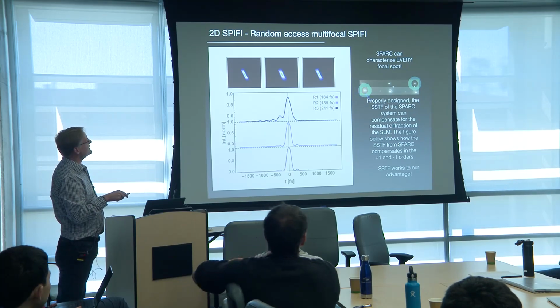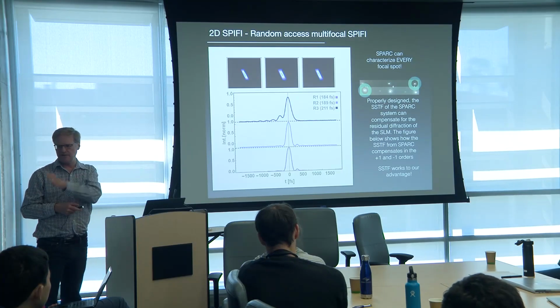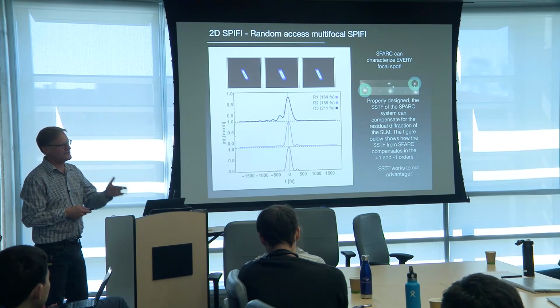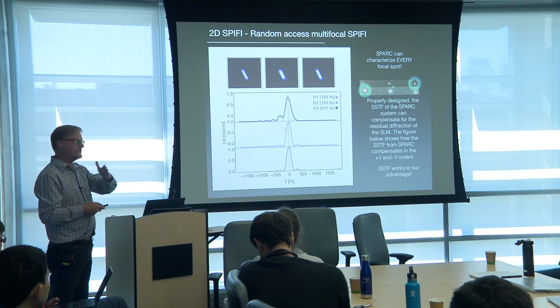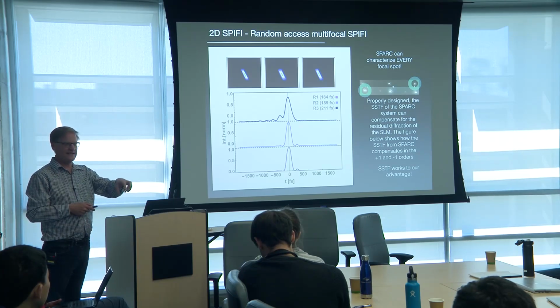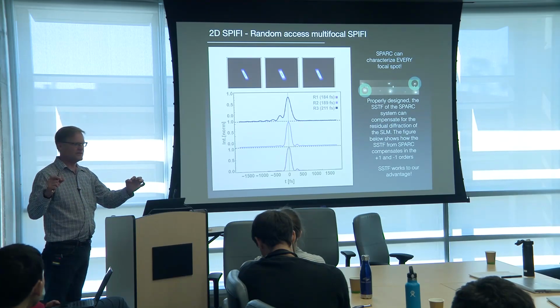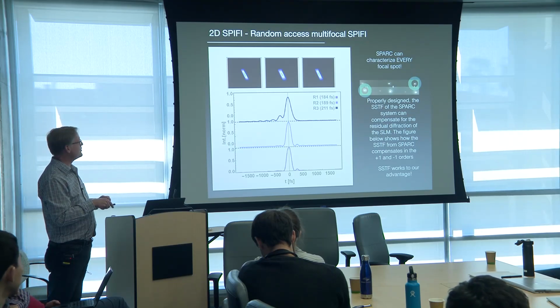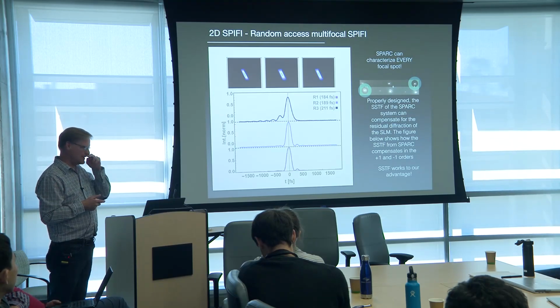And this is nice, so that here's showing the multiple foci where we actually do the spark traces for the individual foci in the focal plane. And not surprisingly, because you're actually using the SLM as a diffraction grating to create all of these, they give you lateral color as you move off axis. That lateral color distorts the beam spatially, and we can see it temporally. So here's the 0th order beam, and this was like the +1, and this is like the -1. And so the -1 is much worse.